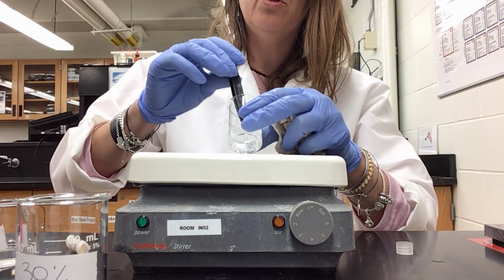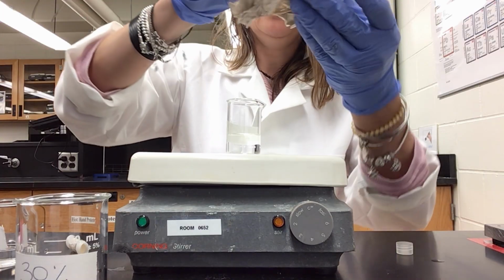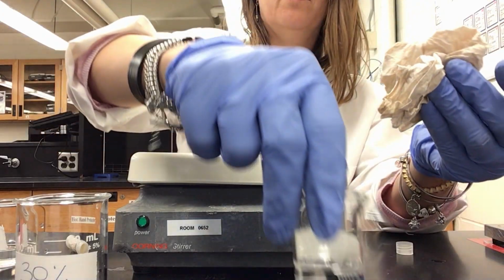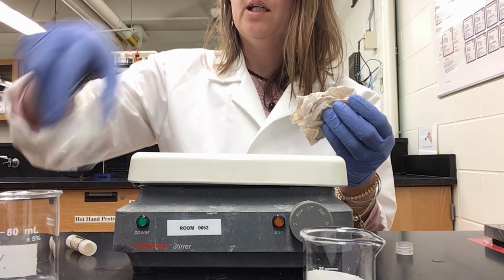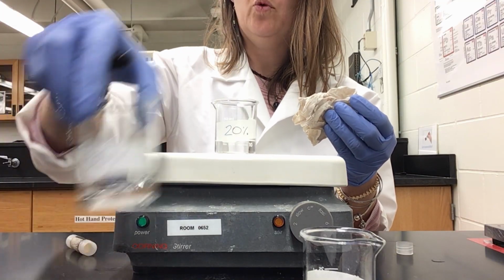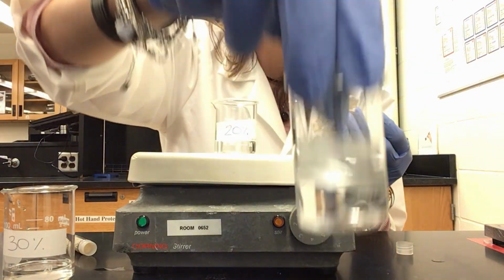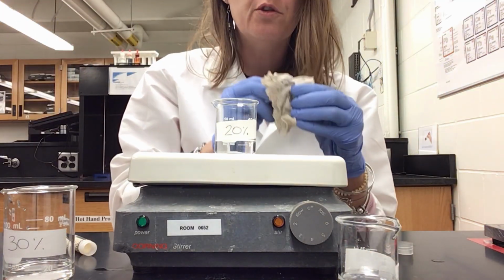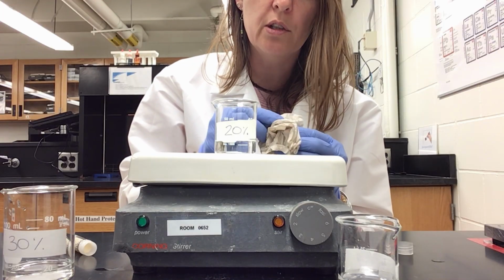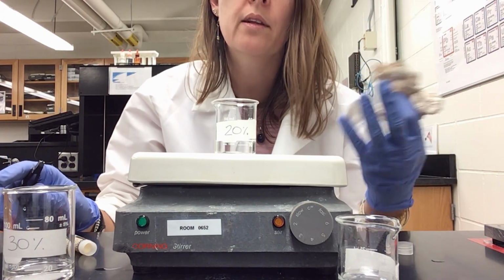I am going to use one of these to take these away. I am gonna dry these, and I'm gonna do the same with the 20 and then with the 30 until they are completely clear like this. This is really important because if the sugar is not completely dissolved, the concentration of the sugar in the solution will not be the one that you wanted.